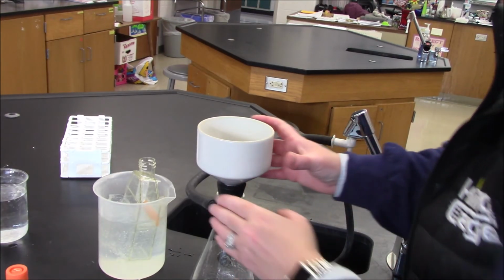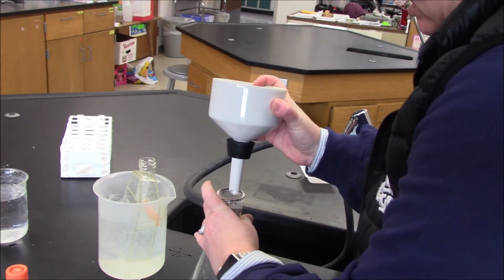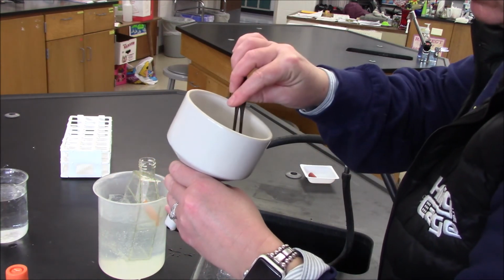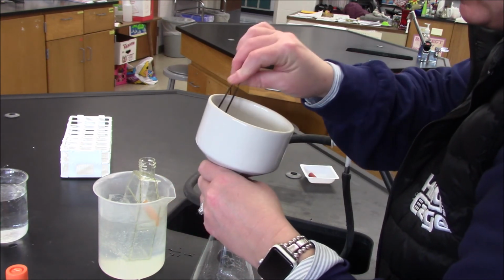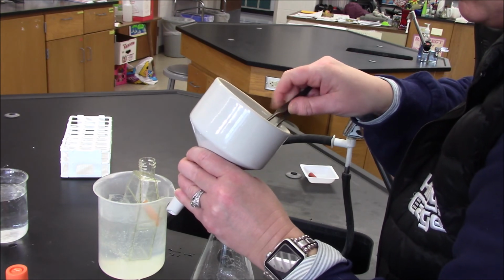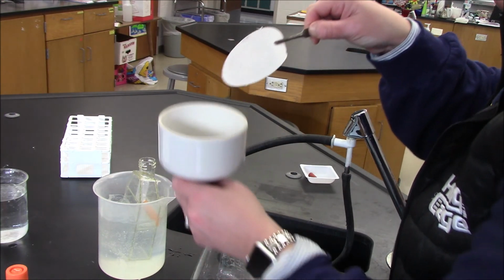Alrighty guys, I'm back and I got it. The way that I got it is, I thought that the filter would be cold enough by rinsing it with cold water, but what I actually did was let some ice cubes sit on it. And now what I have is a collection of some crystals here on my filter paper, which I think is going to be hard for you to see, but maybe not because I can see them.